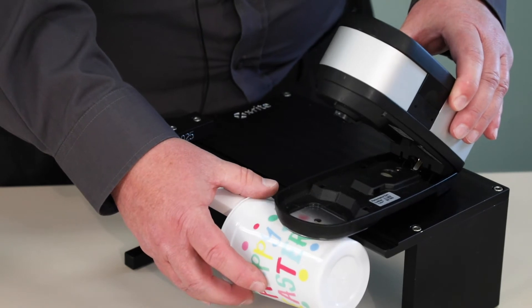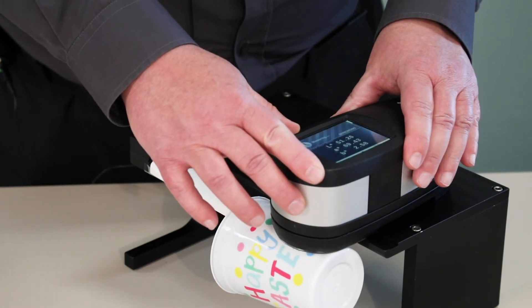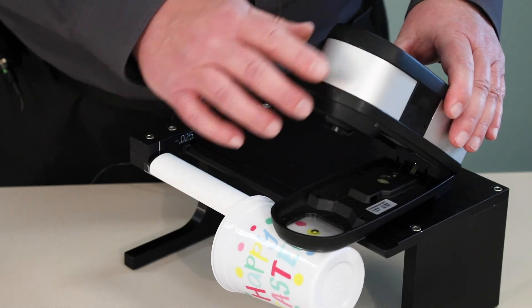If I need to measure another spot, I can rotate the cup, or I can move the instrument along the length of the arm and take my measurement.